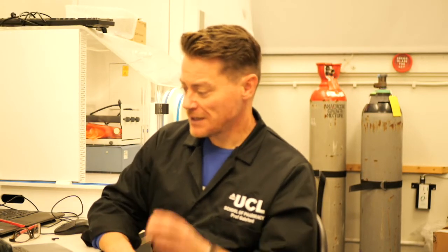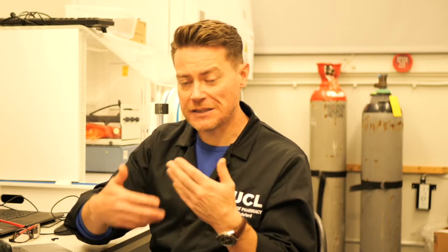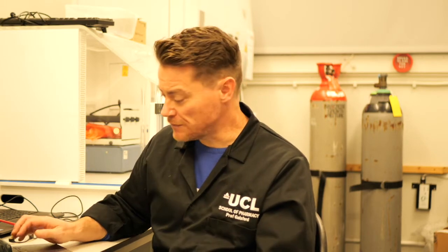So I don't know if you can see this, but if you look at that cross section, in the middle you've got sort of quite a rough powder, and that's the tablet core, but around the edge, I hope you can see, there's a sort of relatively thin line, and that's the polymer coat. And so you can actually measure the thickness of that polymer coat, and it allows you to know how long you need to leave the core in the film coater to get an acceptable enteric coat film.